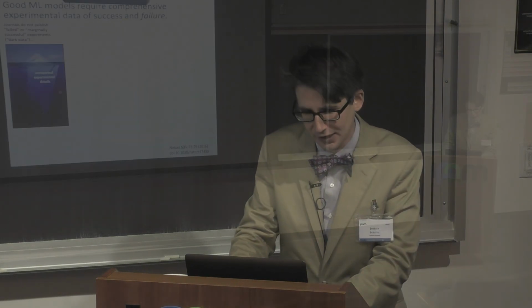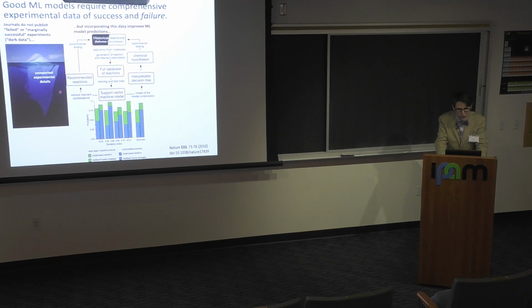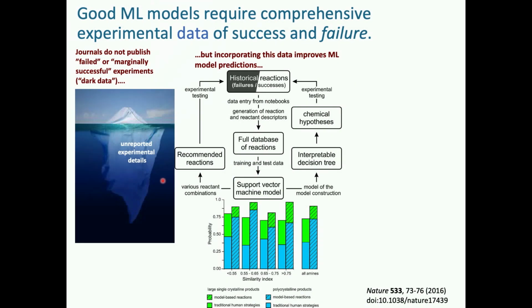And we heard earlier today about concerns about privacy and ways of collecting those into other things. And so what we did a few years ago was we said, we've got all these old laboratory notebooks on a shelf. We're just going to pay a couple of undergraduate students to go through and digitize a decade's worth of old laboratory notebooks. And then with that data, we could build very simple machine learning models that were just as good, if not better, than human experts at predicting reaction outcomes.